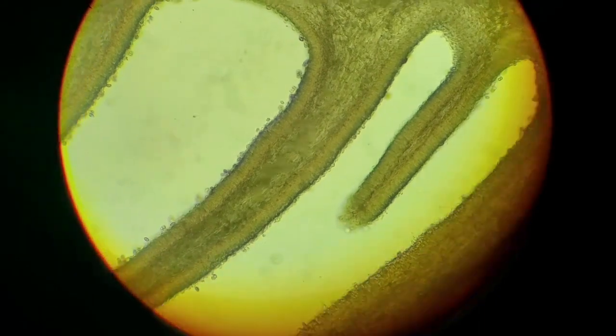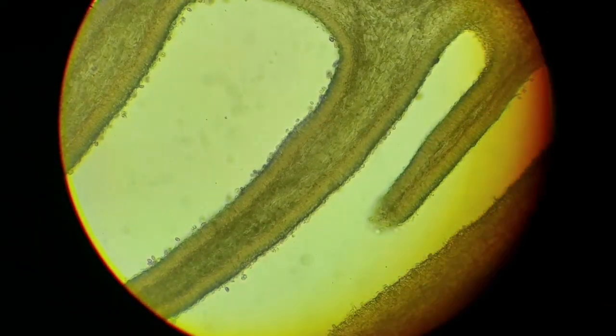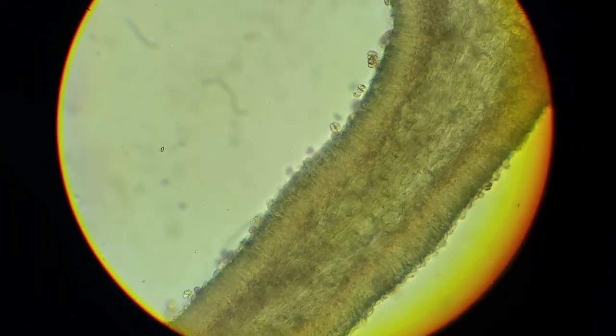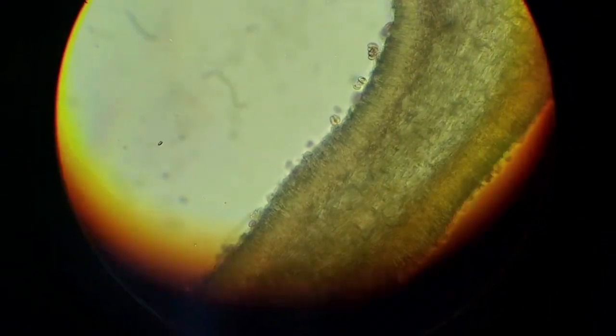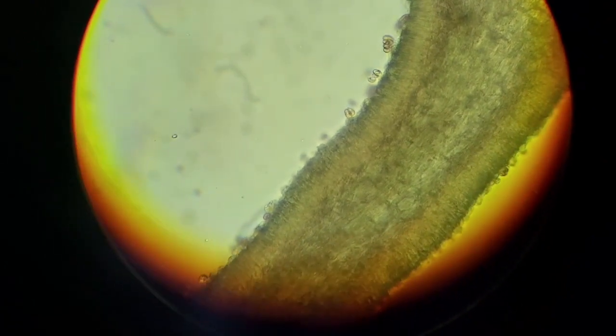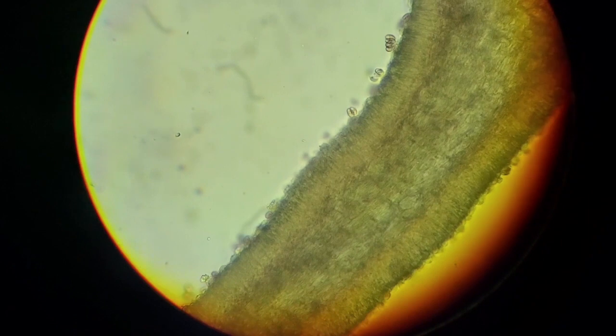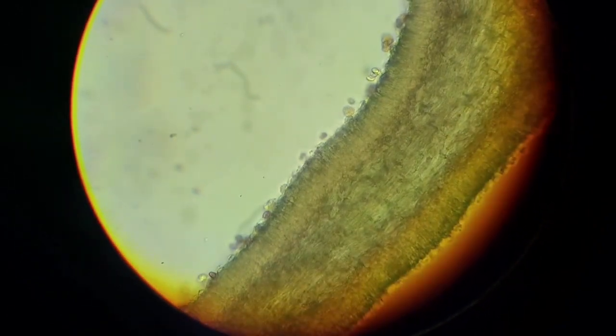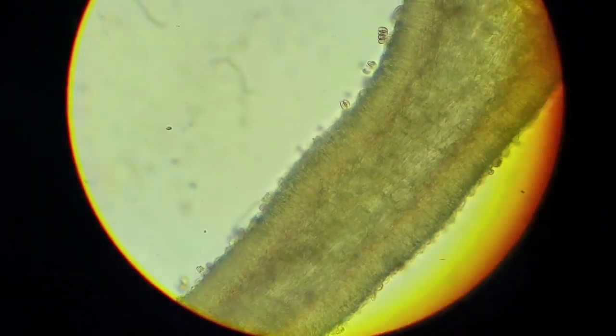So let's get even closer. This gill is very pretty. And you can see the four spores on the basidia. So it's a 4-spored basidia. Let's get even closer.